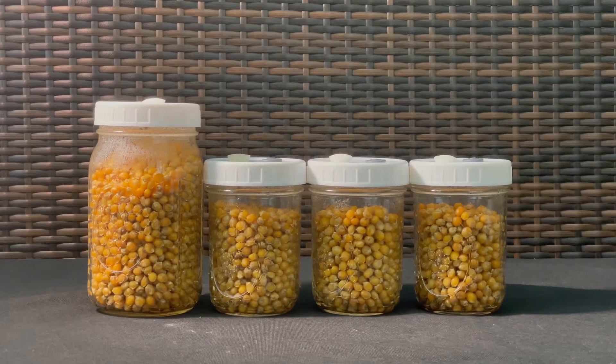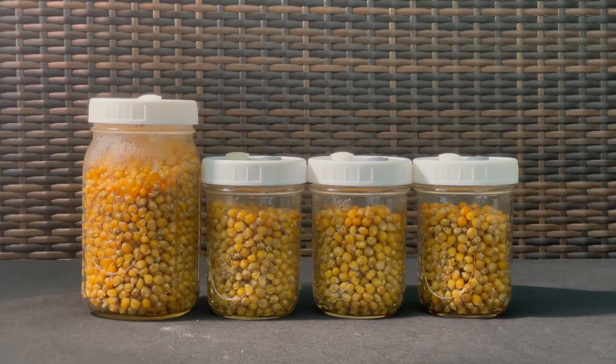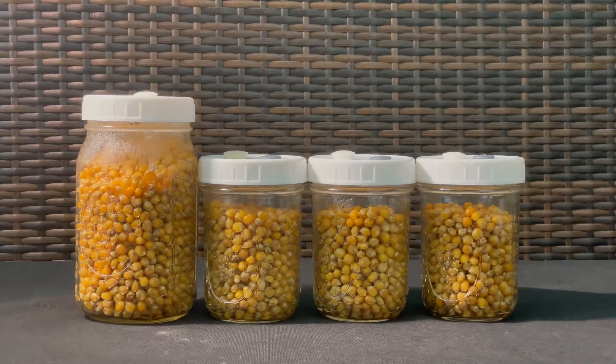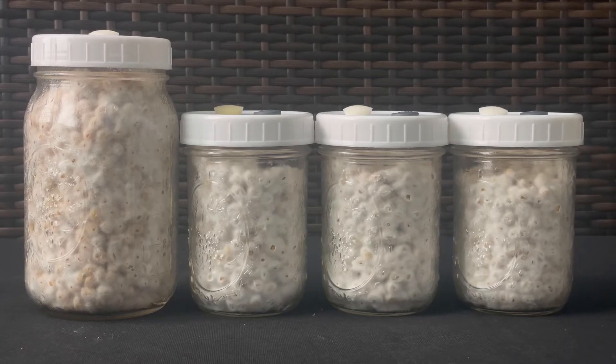In this video, we'll talk about how to inoculate your sterilized jars of grain spawn. You can go from plain grain to this beautiful white mycelium growing in your jars.